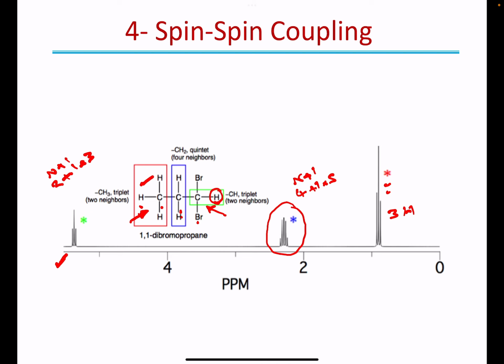And the integration is 3, and 2 protons, and then here is 1 proton.